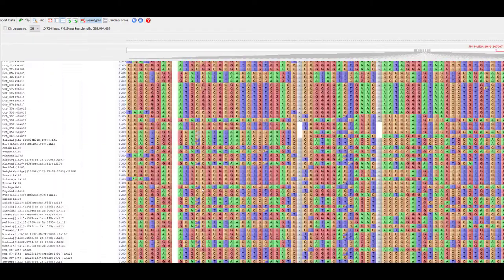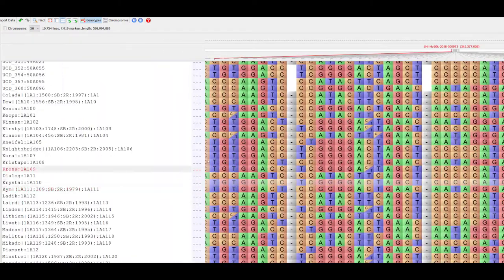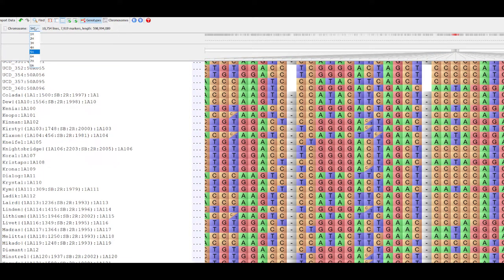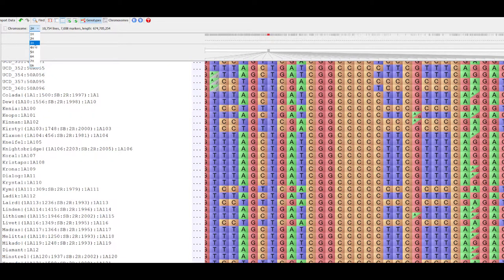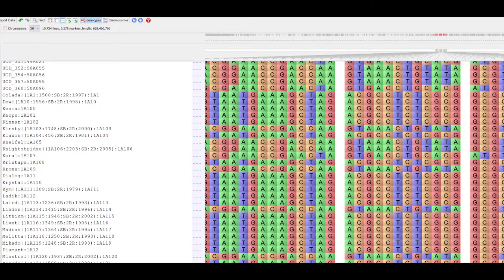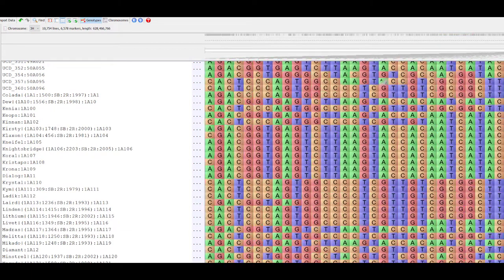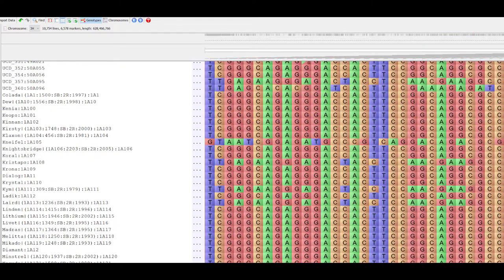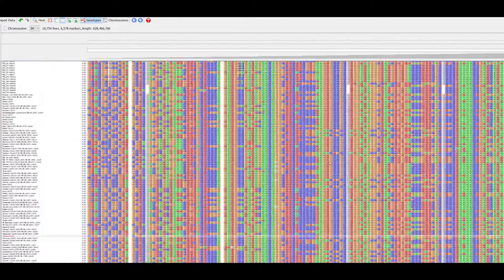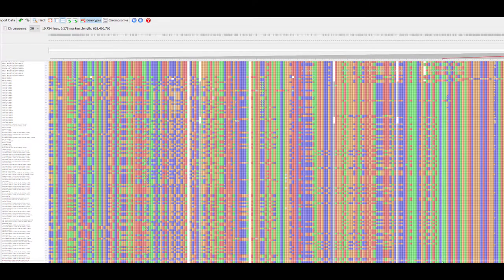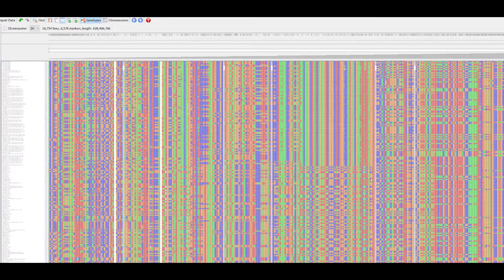Flapjack was developed to handle high-throughput single nucleotide polymorphism, or SNP data, and genotyping by sequencing, or GBS data, from various platforms, providing real-time rendering with rapid navigation and comparisons between lines, markers and chromosomes, with visualization, sorting, and querying based on associated data such as phenotypes, quantitative trait loci, or other mappable features.